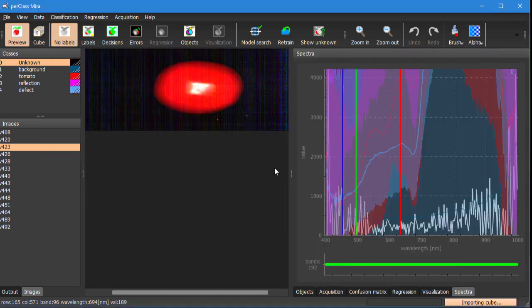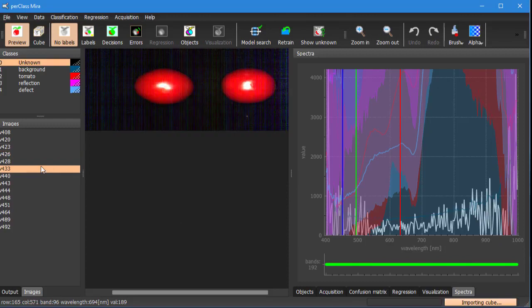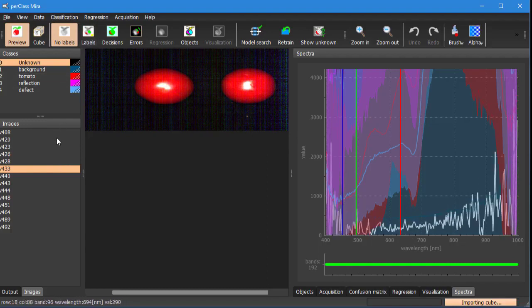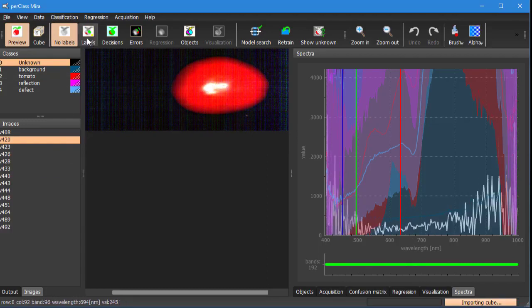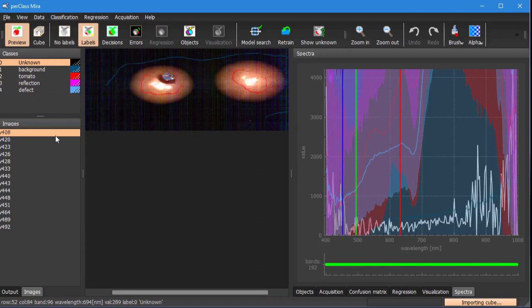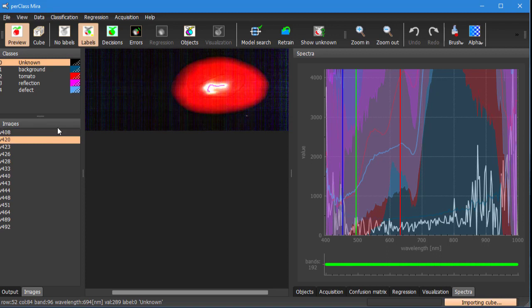Our goal is to build a model that will be able to predict for any new scan the sugar content for each tomato. Because we want to work on the level of tomatoes and we want to deal with objects, the first step will be building a pixel classifier. That is something we discussed already in different tutorials. So here we are starting from an already defined pixel classifier.